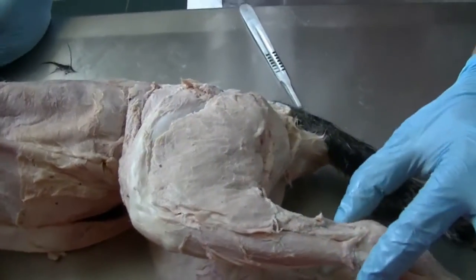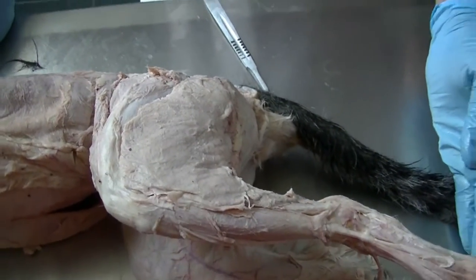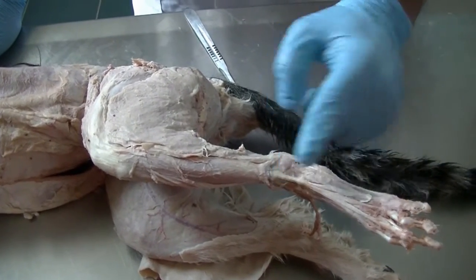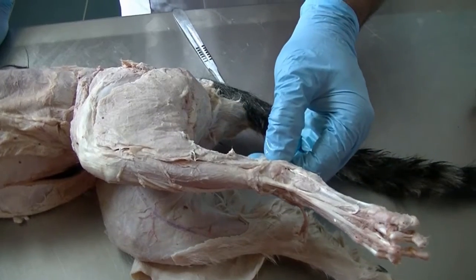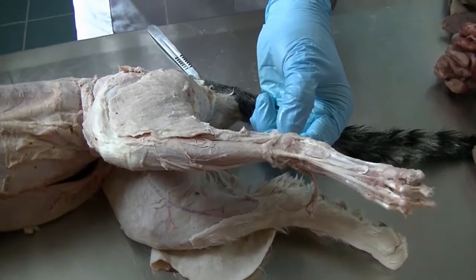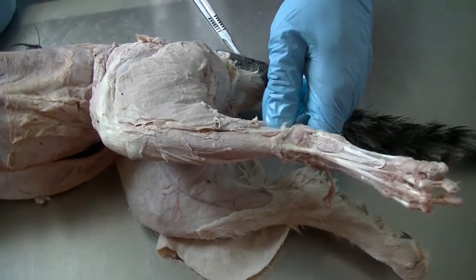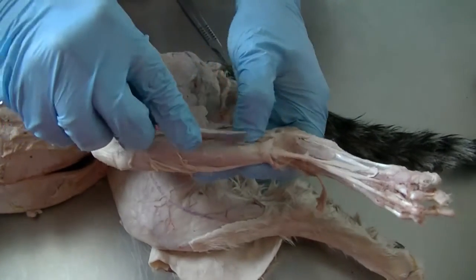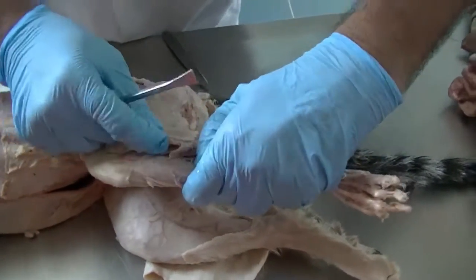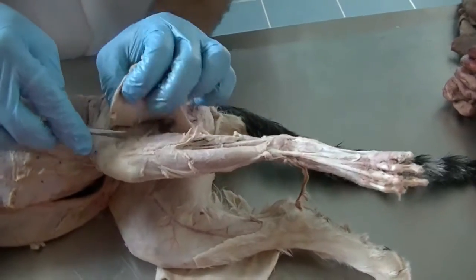As we go to the muscles of the crus of the hind limb, again we have the usual groups of muscle: the extensors of the digit and flexors of the tarsus, flexors of the digit and extensors of the tarsus. Both heads of the gastrocnemius are present, 3 heads of the deep digital flexor, 1 head of the superficial digital flexor, cranial tibial muscle and long digital extensor as well as lateral digital extensor, and peroneus longus are the same as we saw in the dog. But then there is a major difference here.